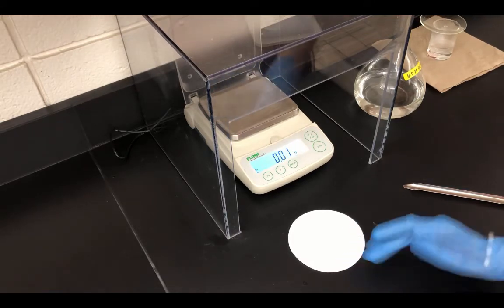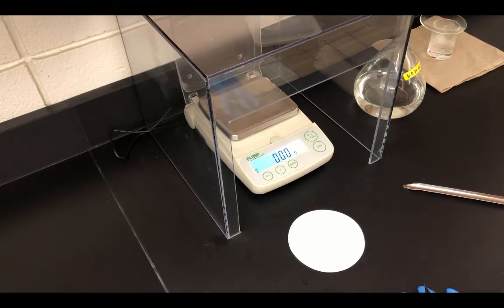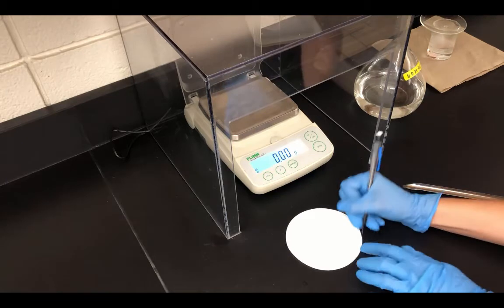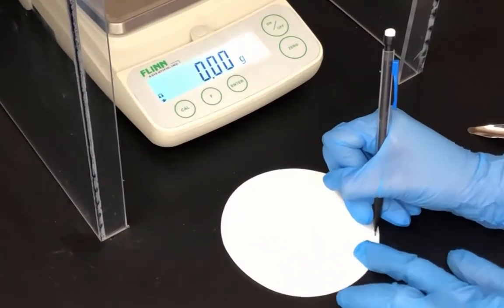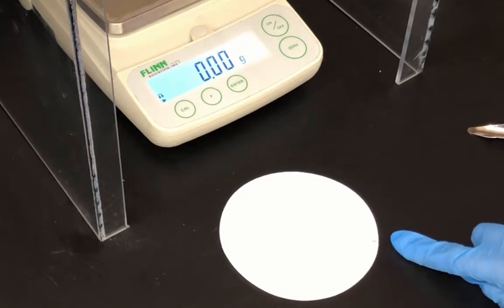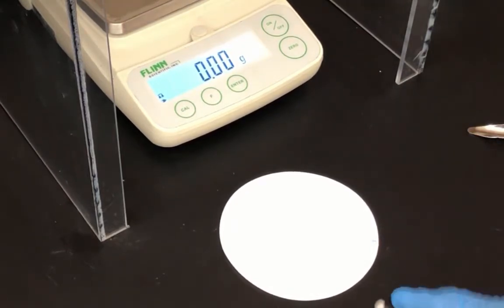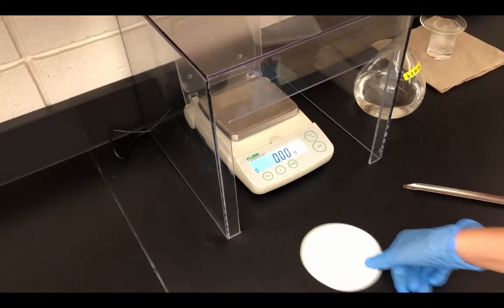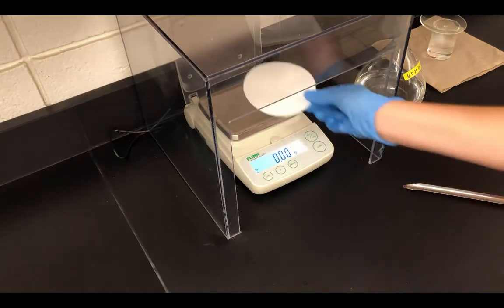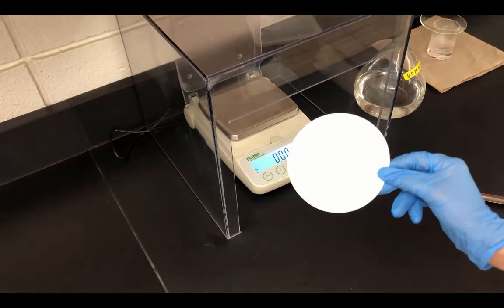So we have a piece of filter paper. Whenever you are filtering, get in the habit of first putting your initials somewhere in light pencil along the edge of the filter paper. You want to use pencil because if you use pen, it will bleed through the filter paper and could potentially affect your results. You always want to record the mass of the filter paper before you do anything to it.